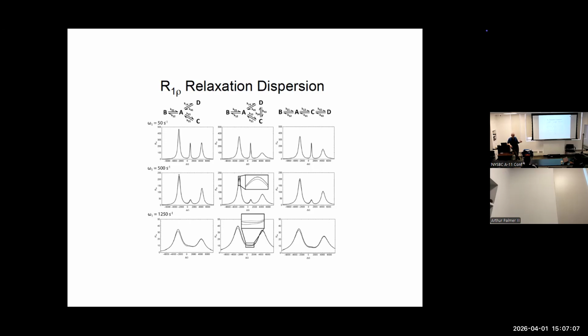There's the theoretical limitation that you always only know the magnitude of delta omega. The experimental limitation is basically how fast you can do 180s. The usual theory assumes that the 180s are instantaneous. And frequently, if we're doing the experiment and we don't want to worry, we might say we don't want the duty cycle of the pulses to be more than 10%, say the delays.